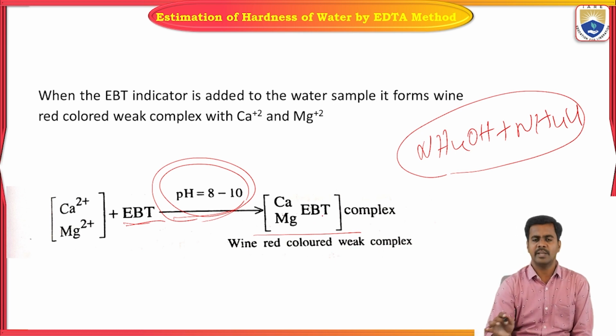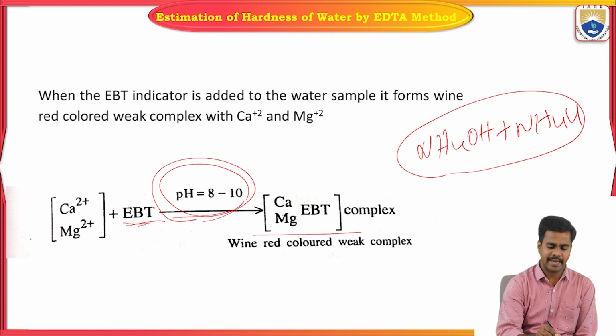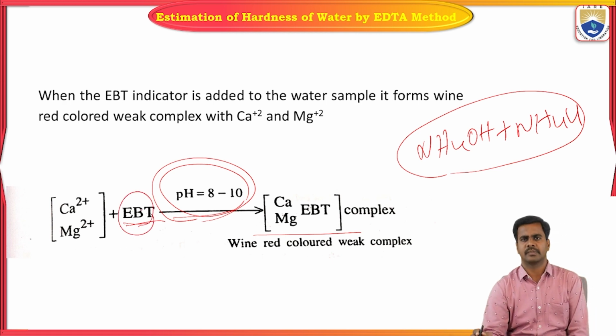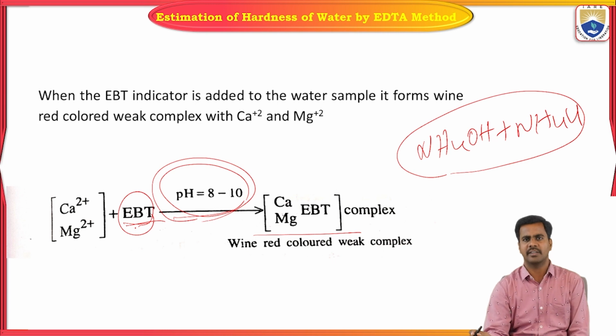Here, EBT acts as an indicator as well as a ligand.